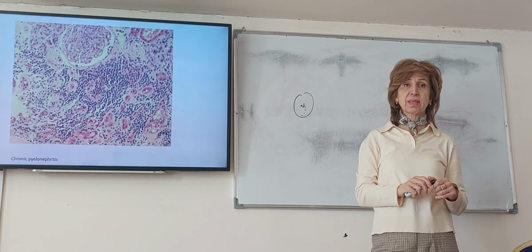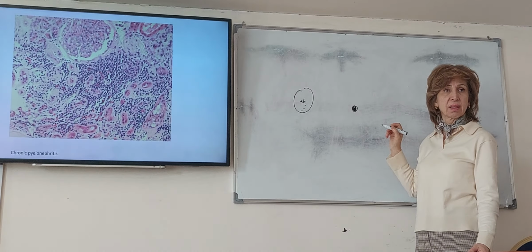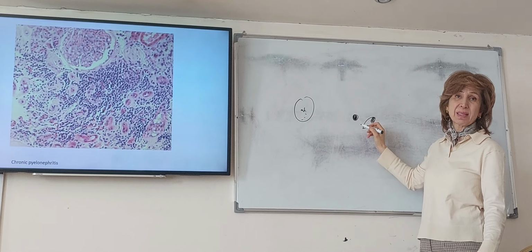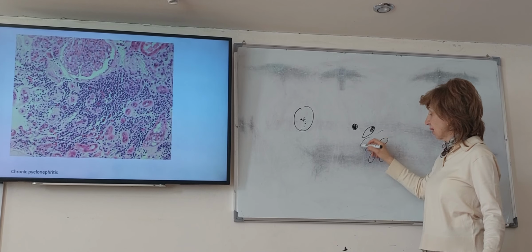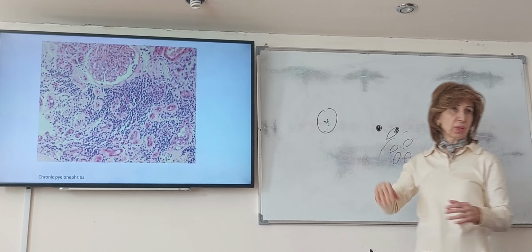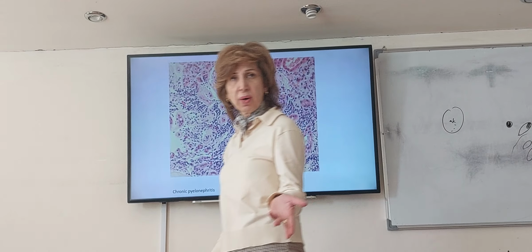Where do I see mast cells? Again, allergy, hypersensitivity reactions. Now these are neutrophils. When I have only this dark color, what is it? Pyknotic. Lymphocytes. When I see the nucleus eccentric, these are plasma cells. Histiocytes are elongated and they don't have distinct cytoplasmic borders. Now the epithelioid we will speak about in the granulomas, but this is in general. So when you see these small dark cells, what are they? Lymphocytes.